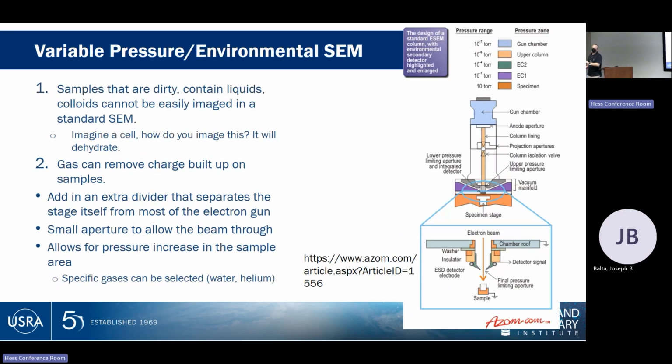there are techniques that we can use to image things that are not coated or to limit the charging effects on things that are not coated. They're not always perfect, but you imagine you want to image a cell, okay? It's going to be difficult for me to gold coat a single cell, but I might very well want to image a red blood cell for various reasons, or skin cells, whatever. It can be very challenging to gold coat a single cell. And I might want to actually image something that's happening to it as it's in there.